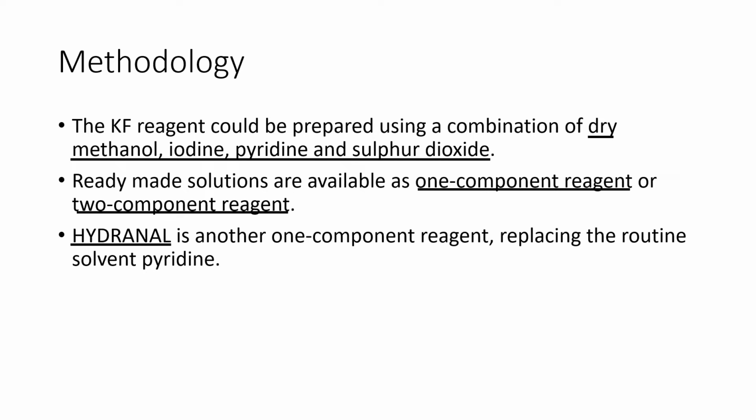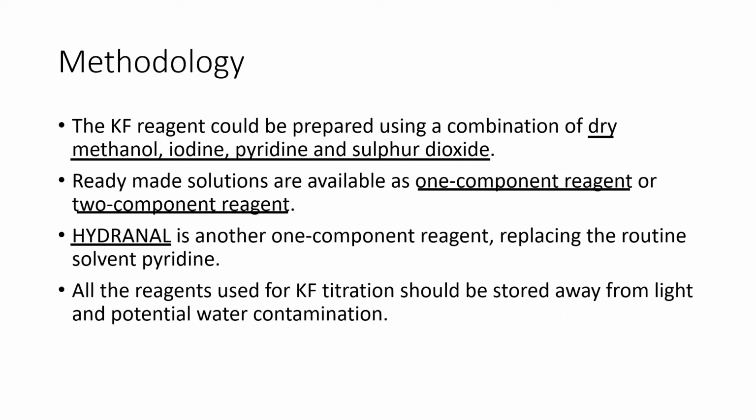Hydranal is another one component reagent replacing the routine solvent pyridine. The Hydranal composite is a good one component reagent that works for ketones and aldehydes also. It has the additional advantage of replacing the health hazard material pyridine. All the reagents used for Karl Fischer titration should be stored away from light and potential water contamination. So it is very important that the reagent is protected well, always away from water and in a low actinic glass bottle.